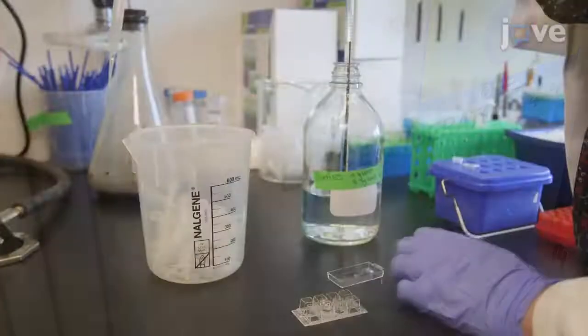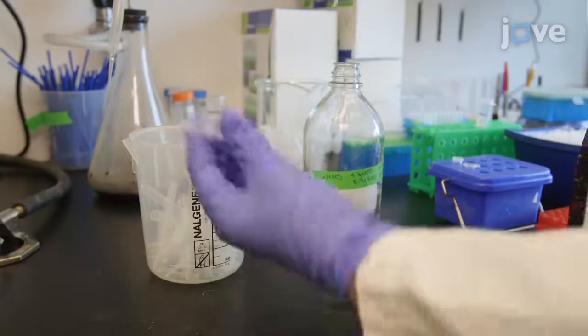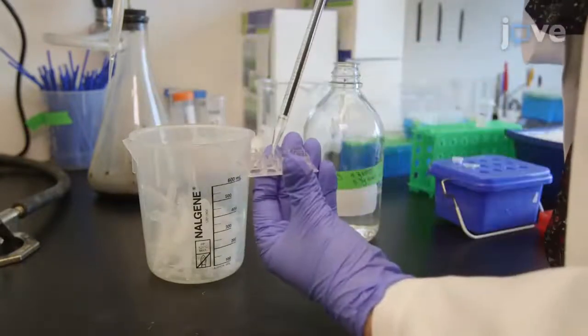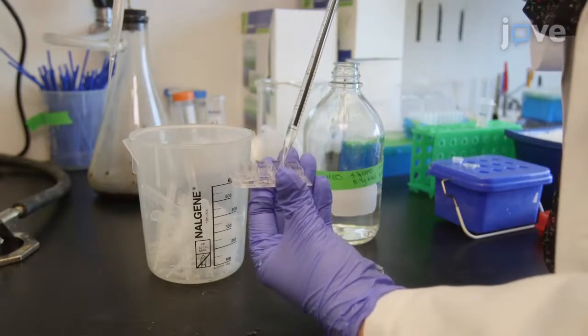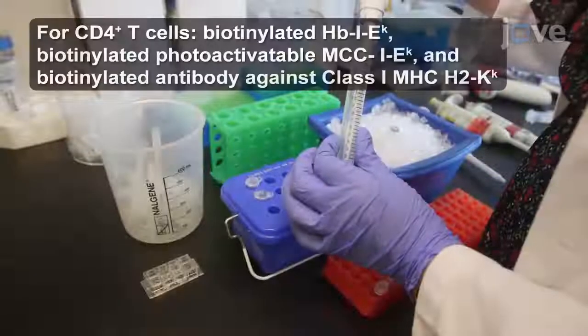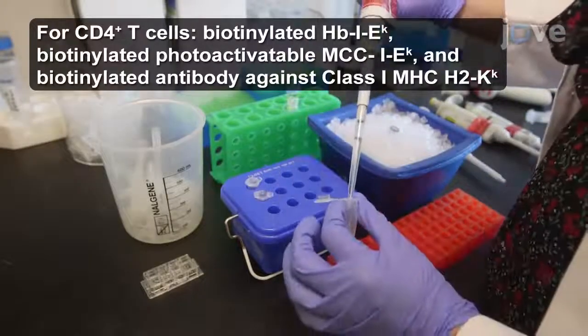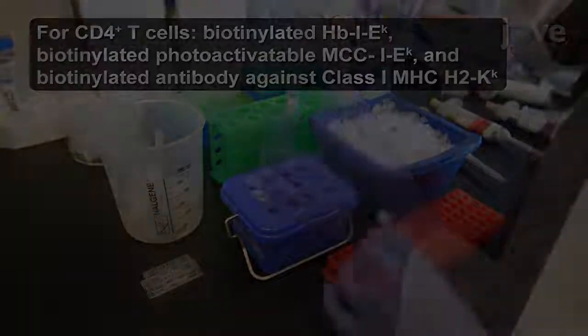After an hour, wash the coated surfaces in HBS. Fill and invert the chamber slide wells 4 to 5 times, removing HBS from the wells. Do not allow the wells to dry. Add the specific biotinylated photoactivatable peptide major histocompatibility complex ligands and adhere.